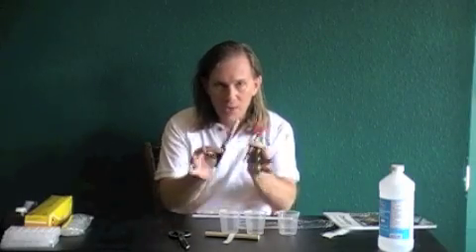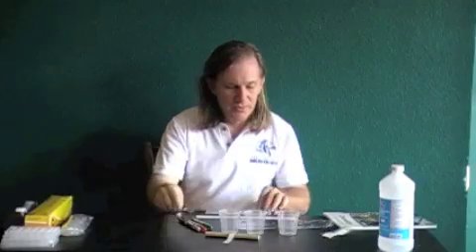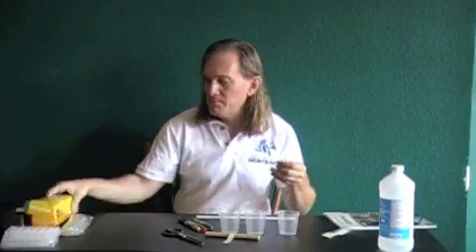If you can't find exactly black, red, and green, black, red, and blue will do — you just need three different colors of permanent markers. Black, red, and green are the ones used in the lab instructions. You'll also need a ruler, a pair of scissors, and some plastic wrap.